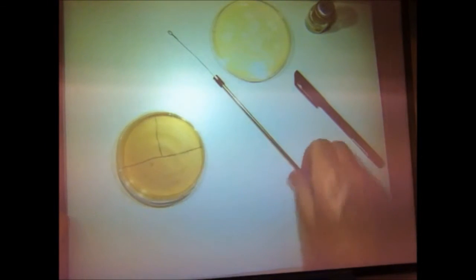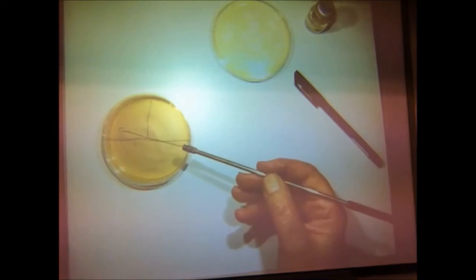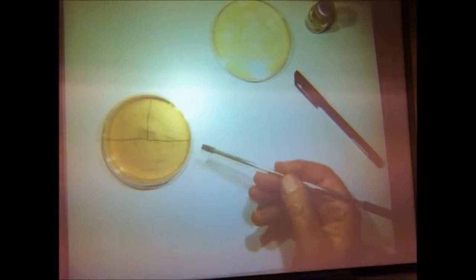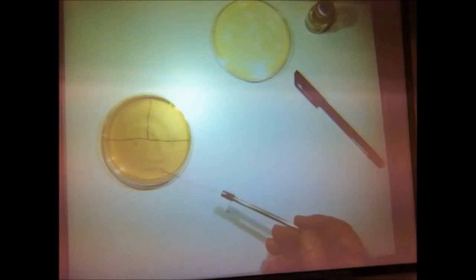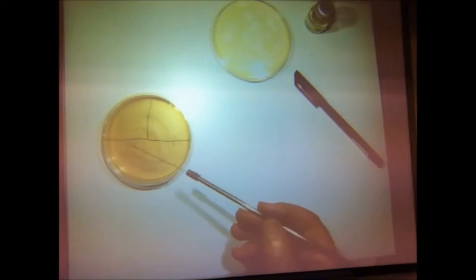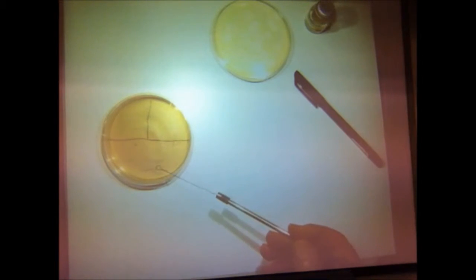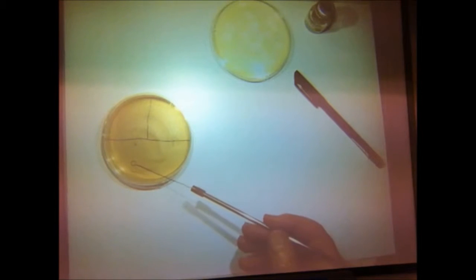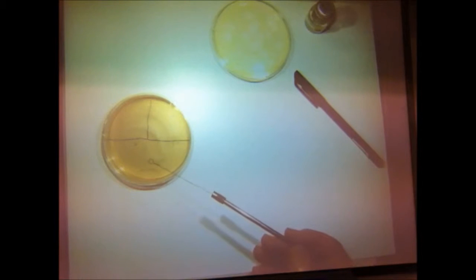The idea of streak plating is that I'm going to take a loopful of the bacterial culture, and I'm going to start in this quadrant here, and I'm going to draw that same loopful across through the second quadrant, down into the bottom half, and across. And as I do so, I'm drawing out the bacterial culture to a thinner and thinner consistency, which means that by the time I get here, you'll be able to see the individual colonies once the plate has actually grown in a day or two's time.